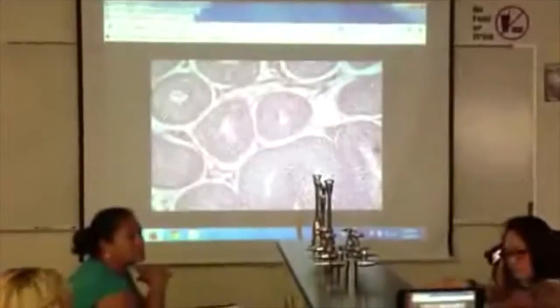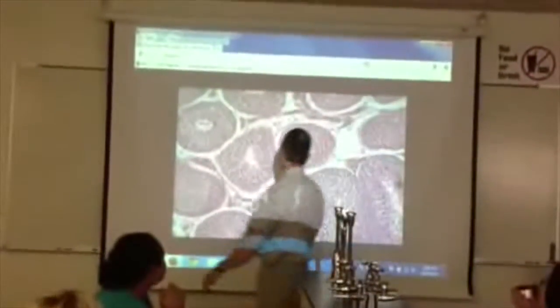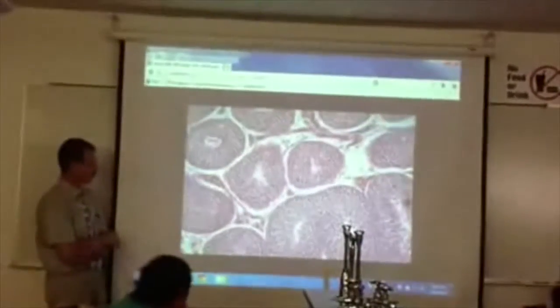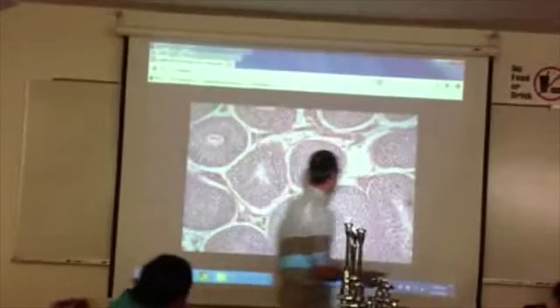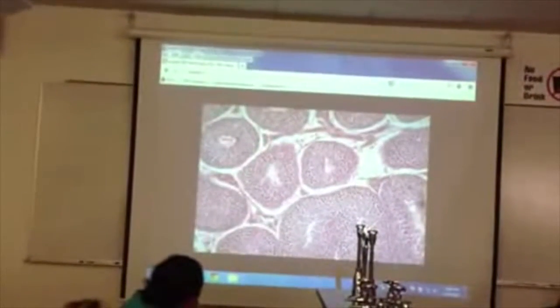One of those puffy seed things. Dandelion. So, when you say testes, though, would you accept seminiferous tubules? Yes. So, where my mouse is pointing, that cell there. Interstitial cells, or Leydig cells. The ones that are between the circles. Too easy. Yep. No problem.